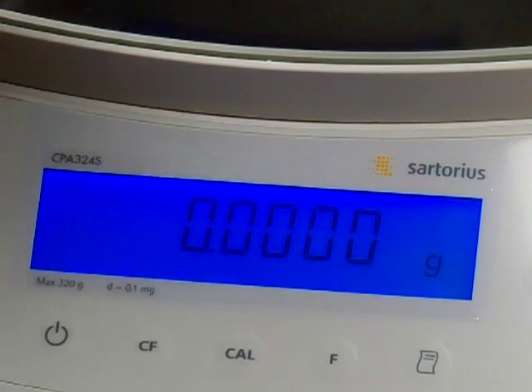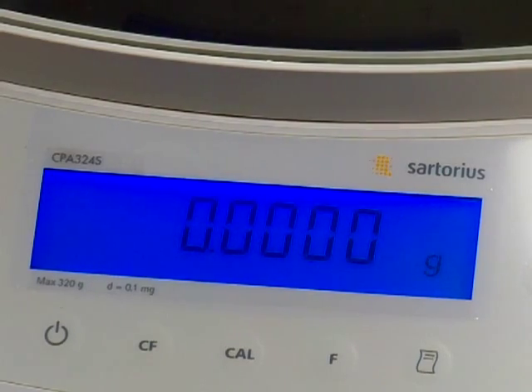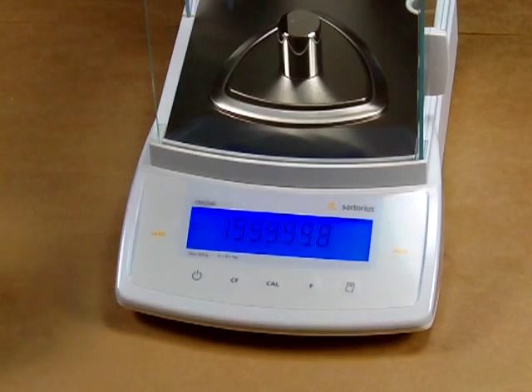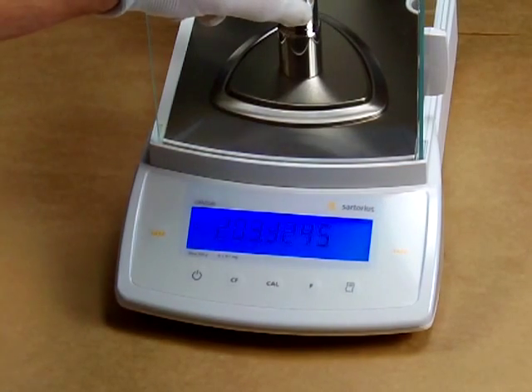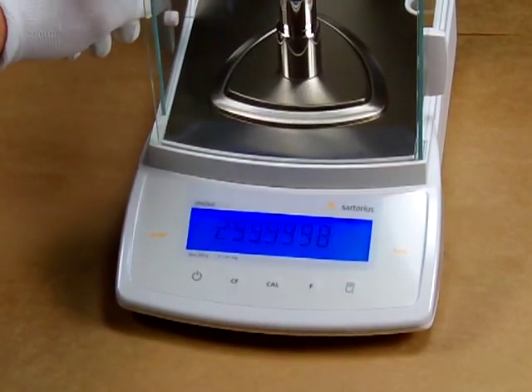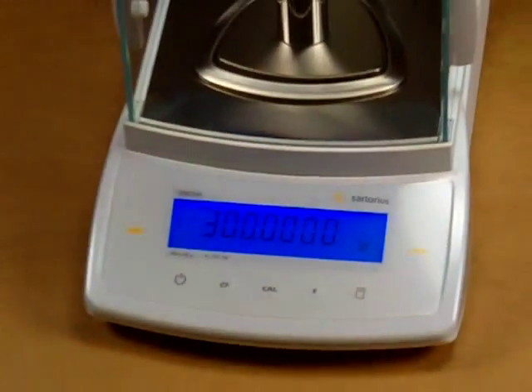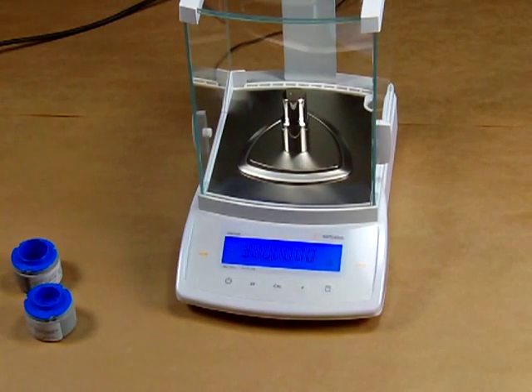And there you go — the balance goes to 0.00. Now we take the weights off and confirm. And there you have it — the balance is right on the money. This is the Sartorius CPA324S, always in stock at balances.com. If you have any other technical questions, please give us a call. Thank you.